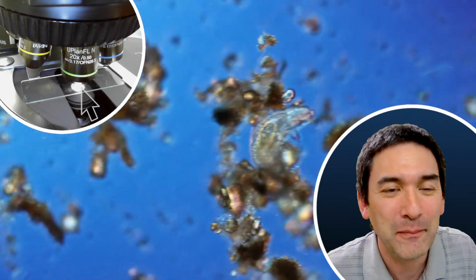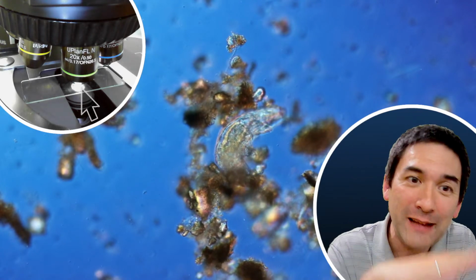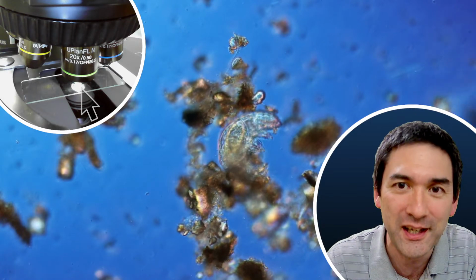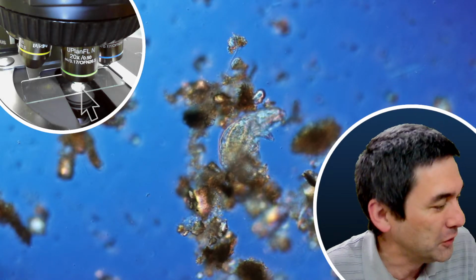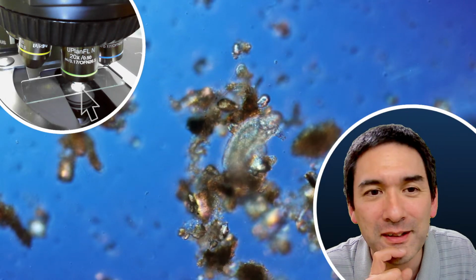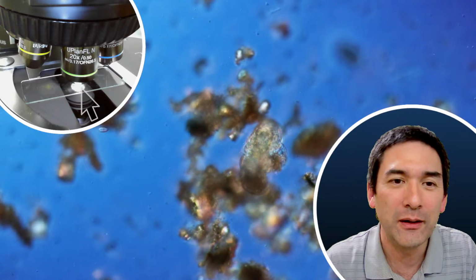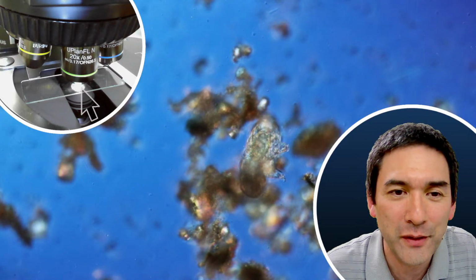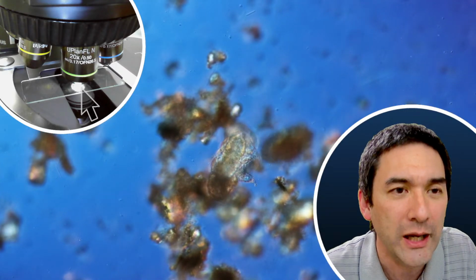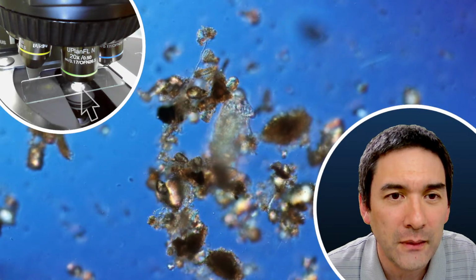Yes. So if I now put a cover glass on top here to make it a little bit flatter, then there is of course again the danger that I'm going to lose it out of sight. Okay, but I could go up higher with the magnification though, right? So we've got one. And I want to talk a little bit about those tardigrades now. Now that we've got one, I'm using now the 20 times objective. Okay, just for your information.